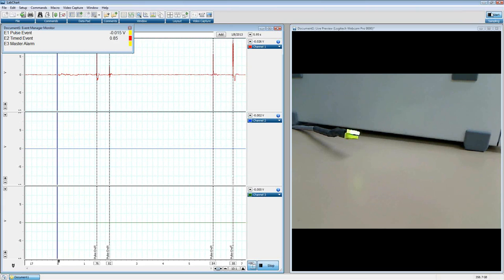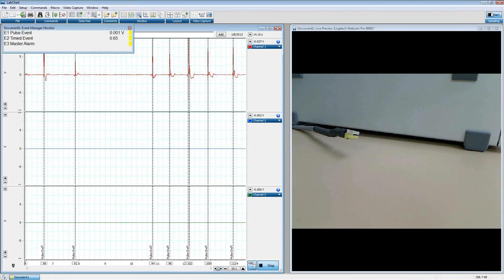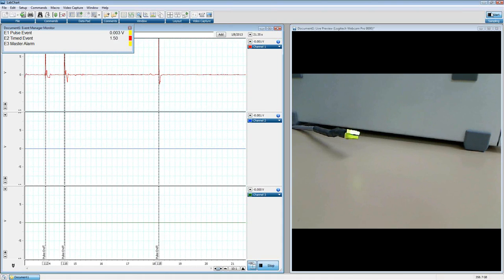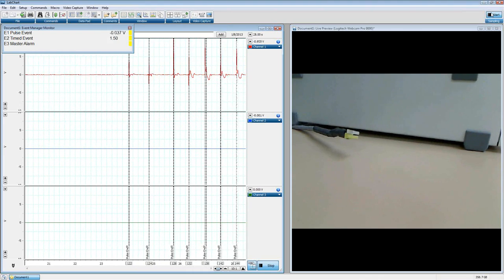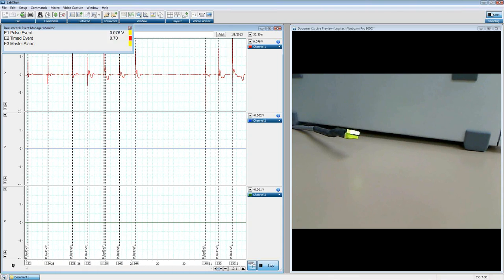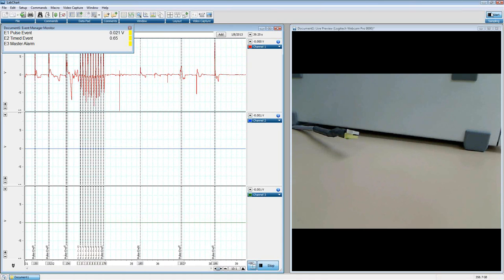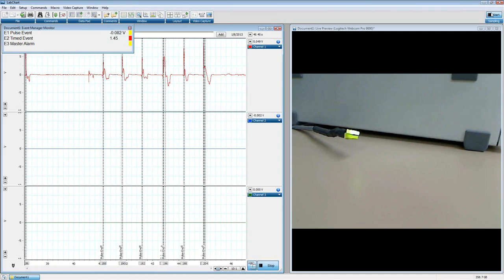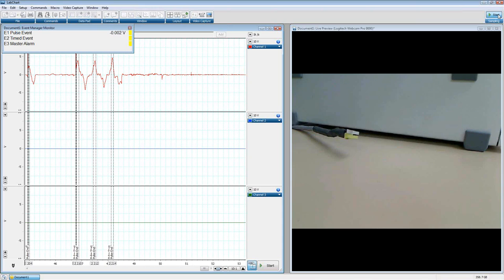Our event turns on at 5 seconds. You'll see it actually turns on. We have our other light coming on as well. Our green light comes on. Now our yellow light flashes every time we trigger that master alarm. Hopefully you can see that on the camera. You can see it flash the bottom light. Ever so slightly. There we go. So, great way to link different events together and to actually either tell our devices to do things, show warnings, et cetera, et cetera.